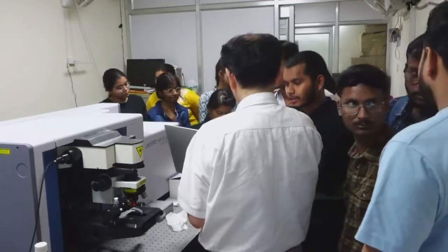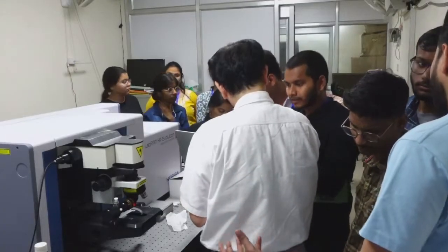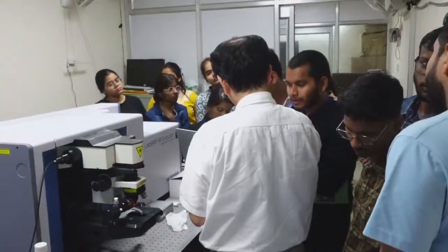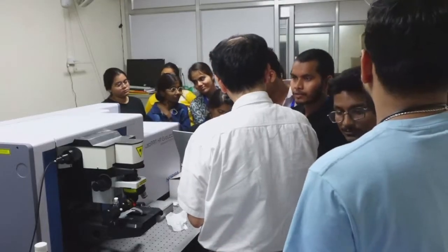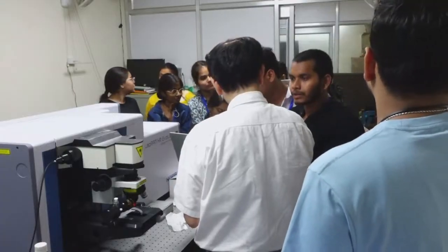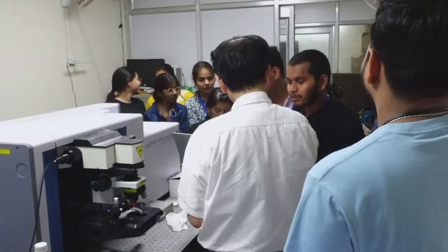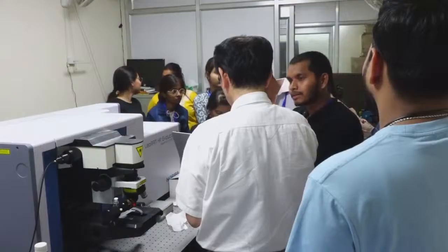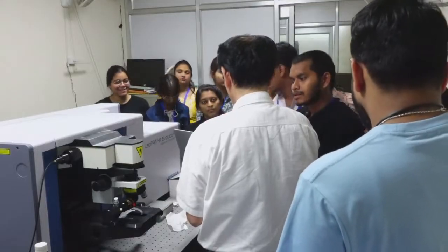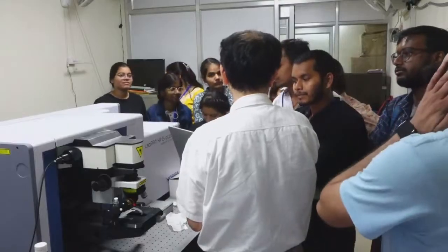Sir, I have a question. If we have a blood sample and we have another sample containing water, iron and oxygen in the same ratio as blood, do both make the same graph? Including water or not? Yes, sir. Then the concentration becomes different.